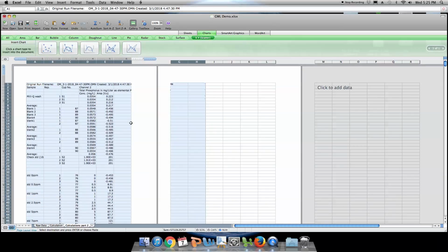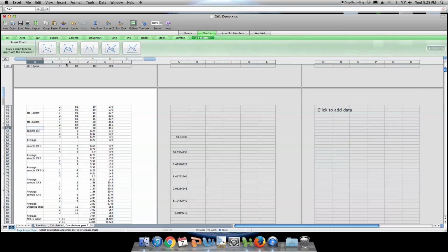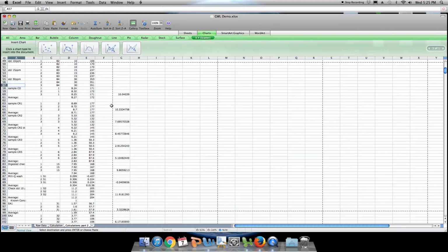Okay, very good. Now comes the fun bit, when we actually begin to erase some of the data, some of the rows that we don't need. And I'll halt the recording now.